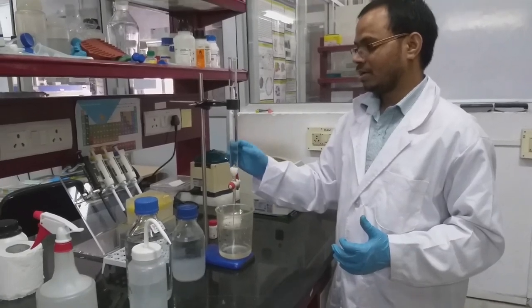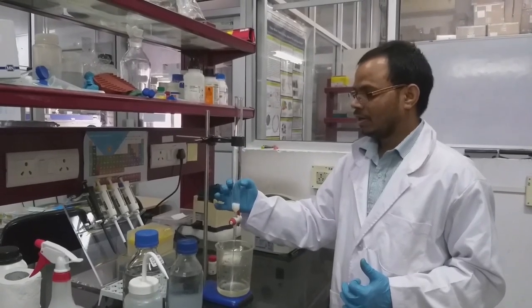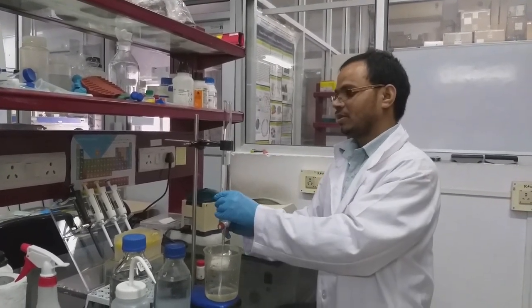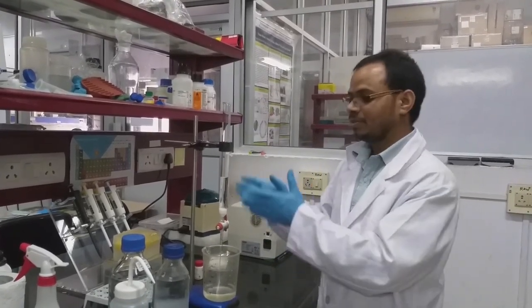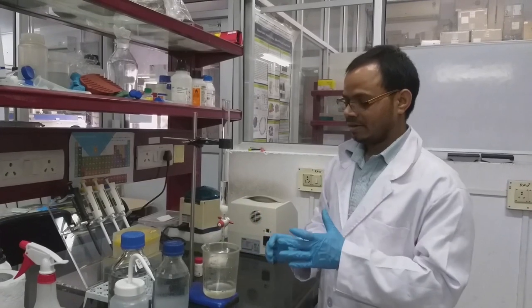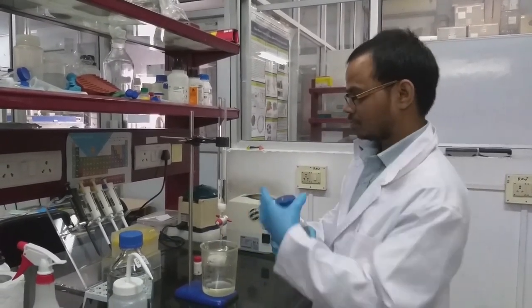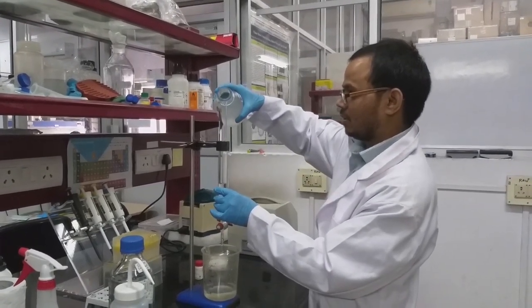Once the soaking in the sodium phosphate buffer is over, we have to keep at least 1/4 of buffer in the column itself. Then we will load the beads. You cannot load the complete beads directly because it may disturb the column packing. So we will load the beads and let them settle by the influence of gravity. These are the beads. I'm just going to add the beads.